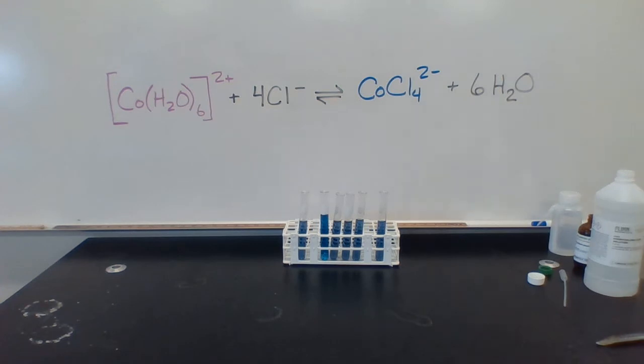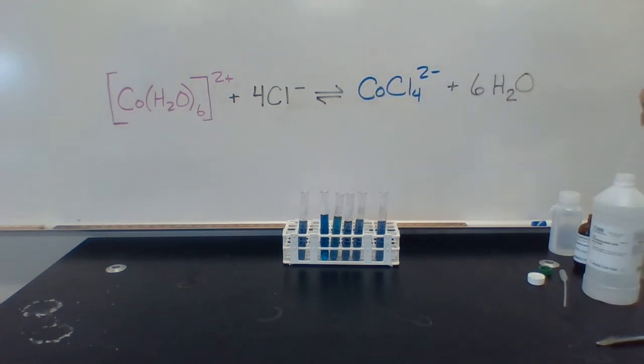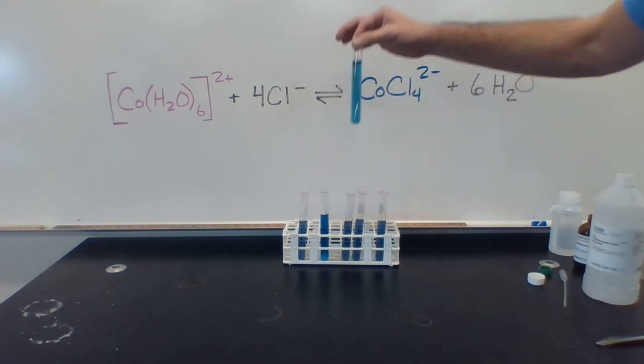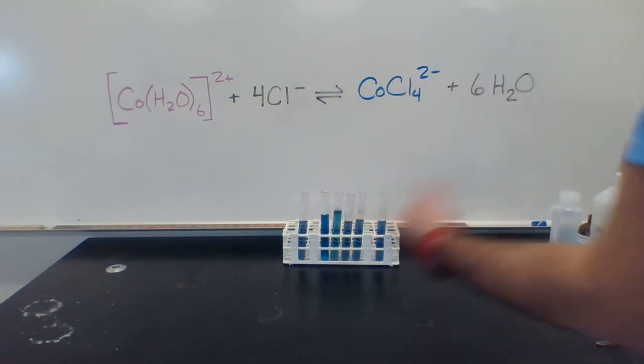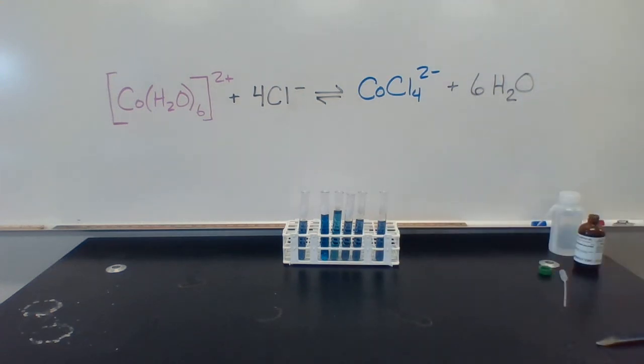In a previous demo, we saw that acids can change the pH and can change the color of indicators, but the acid can also provide ions from itself. This is hydrochloric acid. Initially we added a solid. Here, I'm adding aqueous HCl. We're seeing a color change again, but that color change is a little bit different in terms of amount, and hopefully that makes sense when we think about how much pure reactant or product we add when we add a solid to dissolve versus an aqueous solution that contains that same ion.